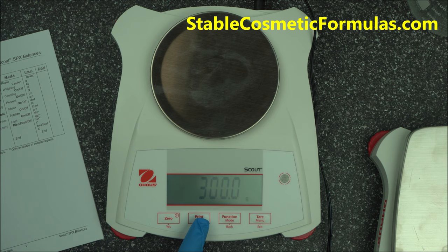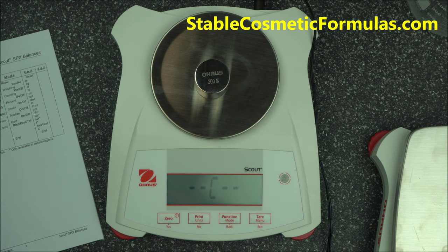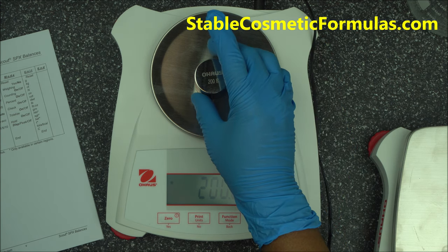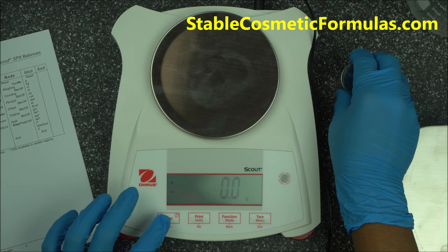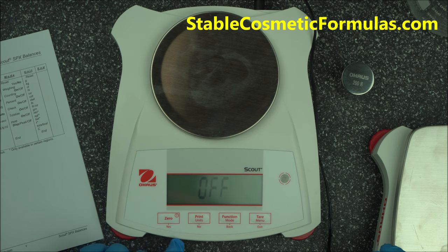Keep pressing NO and it will show you other available calibration weights. Once you find the 200 gram option and you have that weight, place it on the scale. When calibration is done, remove the weight, turn it off, and you're good to go. You can then turn it back on and continue using the scale.